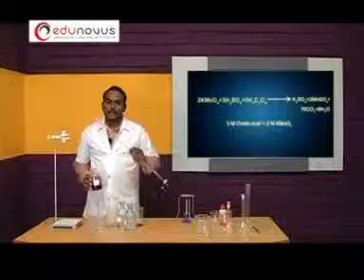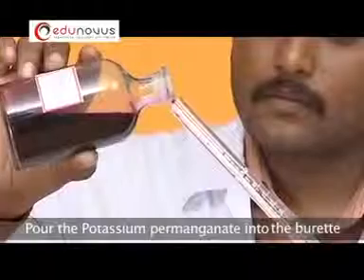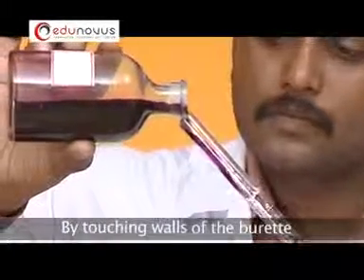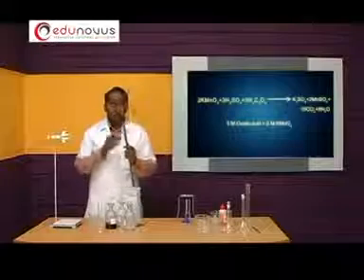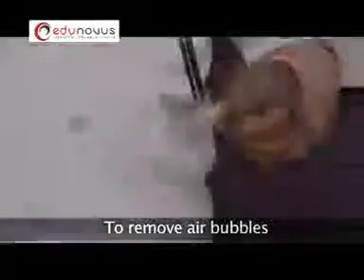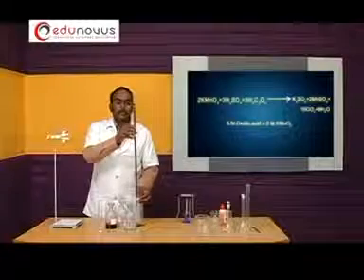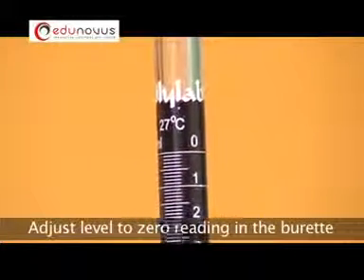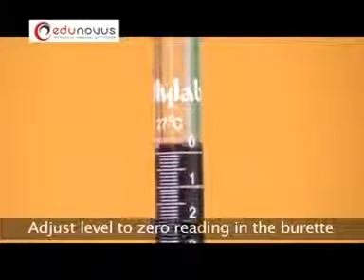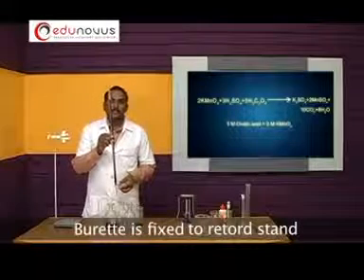Hold the burette at an angle of 45 degrees and pour the potassium permanganate solution by touching the walls of the burette. Now fill the burette along with the nozzle. Therefore, no air bubbles ought to be present in the nozzle, and adjust the level of potassium permanganate in the burette up to 0 level. As it is a colorful solution, the upper meniscus of the solution should be considered for the reading. Now fix the burette to the retort stand.